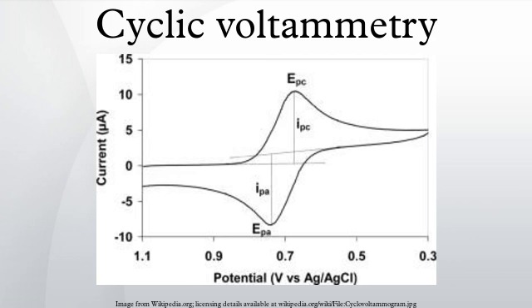The solvent, electrolyte, and material composition of the working electrode will determine the potential range that can be accessed during the experiment. The electrodes are immobile and sit in unstirred solutions during cyclic voltammetry. This still solution method gives rise to cyclic voltammetry's characteristic diffusion control peaks. This method also allows a portion of the analyte to remain after reduction or oxidation so that it may display further redox activity.